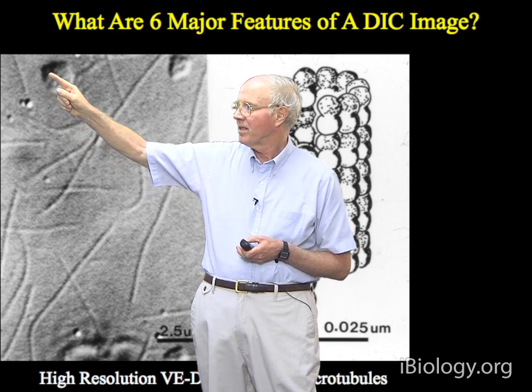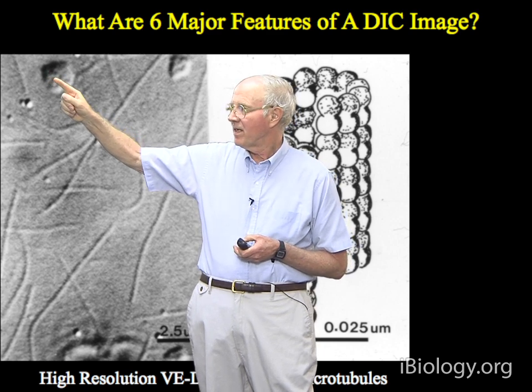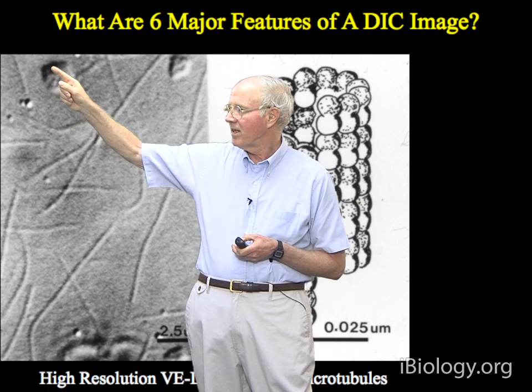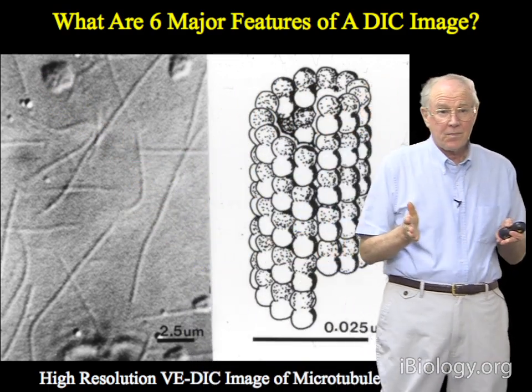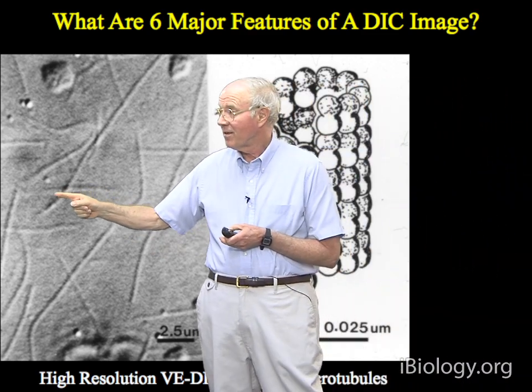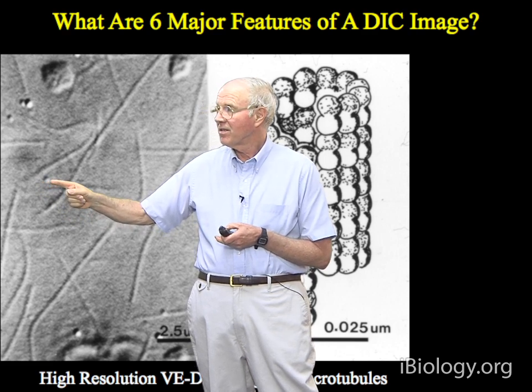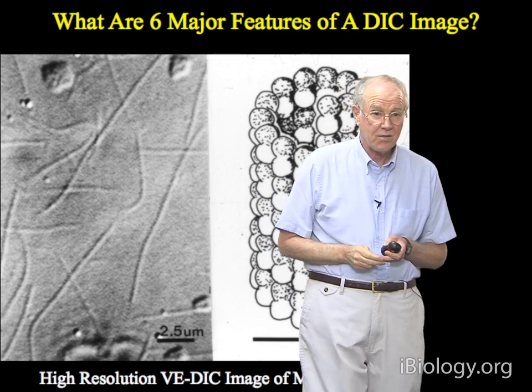And then finally, when we get to the left edge, we now have blacks that don't have corresponding whites to overlap them. And so on the periphery of the left edge, we now get black contrast. So fundamentally, the mechanism that generates contrast of this tiny little point object is the same mechanism that generates the edge contrasts that you see in the DIC.